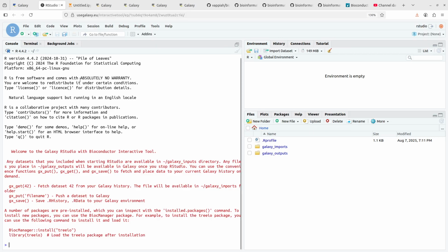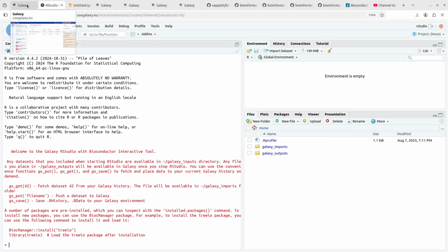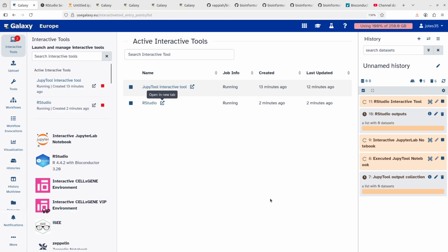All right. So in a nutshell, Galaxy offers lots of tools for bioinformatics, and so you may not necessarily need to set up these tools on a local computer, but you can harness the usability of Galaxy to do your work online.